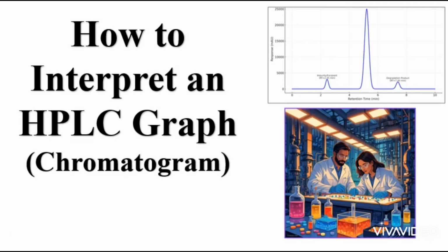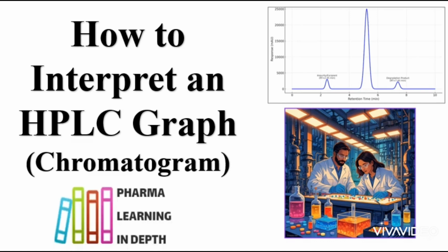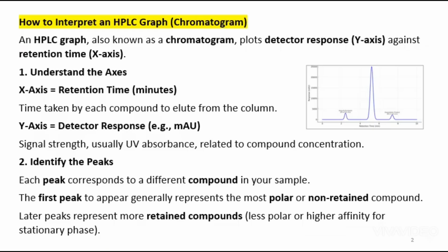Understanding the HPLC technique and the HPLC chromatogram is very important, and it is required in the pharmaceutical field. We should understand how to interpret the HPLC graph. It is also called a chromatogram, as it is the result of the chromatography technique of analysis. How to interpret an HPLC graph or chromatogram.